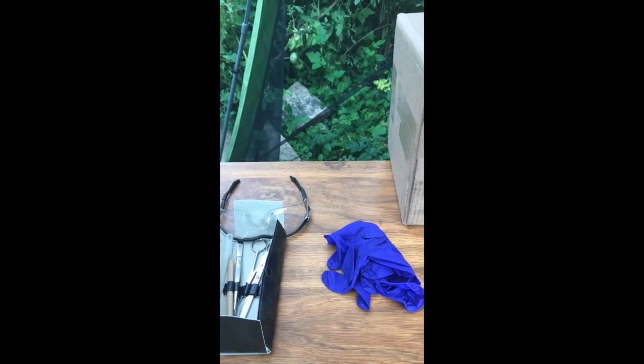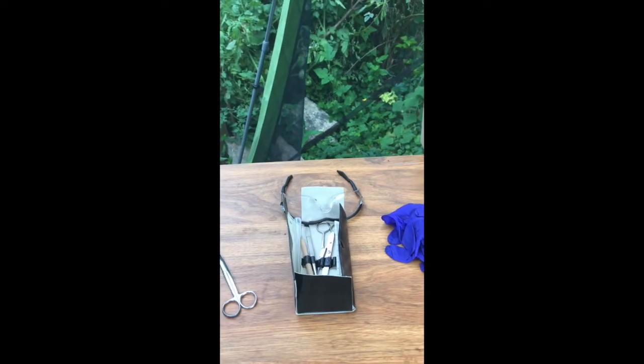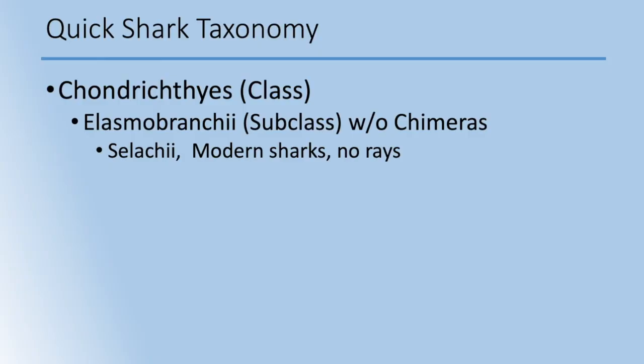So now that we've got all the safety things in order, I'm gonna go get a dogfish shark. Let's do a little bit of quick shark taxonomy. Sharks are in the class Chondrichthyes and the subclass Elasmobranchii, and that excludes the chimeras, which are also in the class Chondrichthyes. The modern sharks, the sharky sharks, as I like to call them, which would exclude the flat sharks and rays, are in the group Selachii.